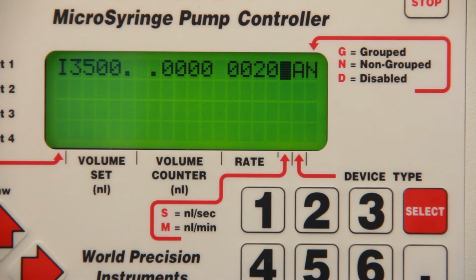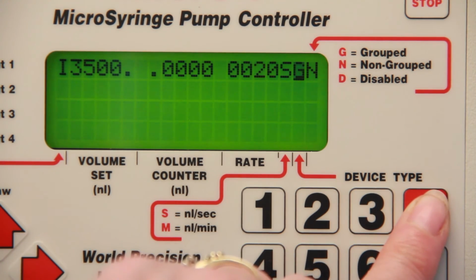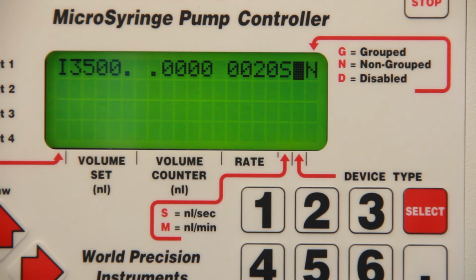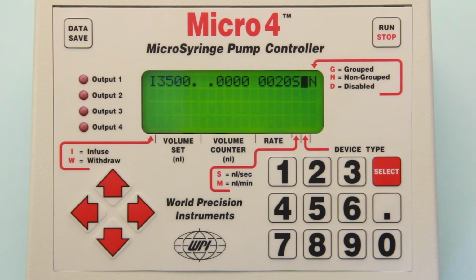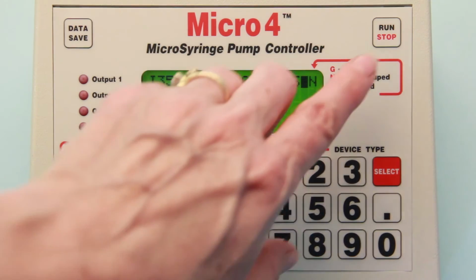The physical characteristics of 11 microsyringes are already in the Micro4's memory. The 100 microliter syringe we're using here is represented by the letter G. So I'll press the Select button until G is shown. I'll press Data Save. Finally, press Run to start the pump.